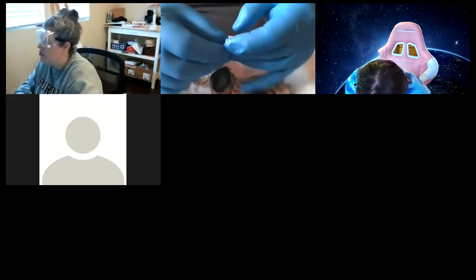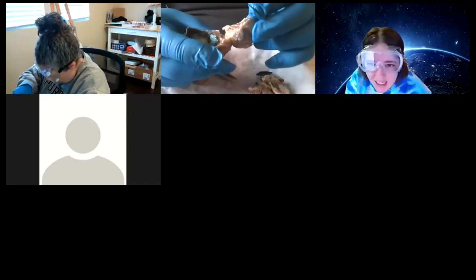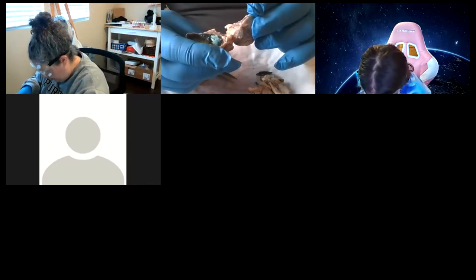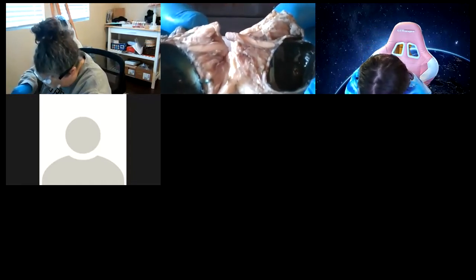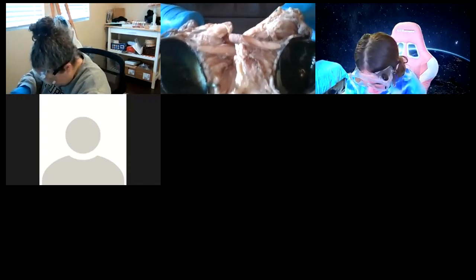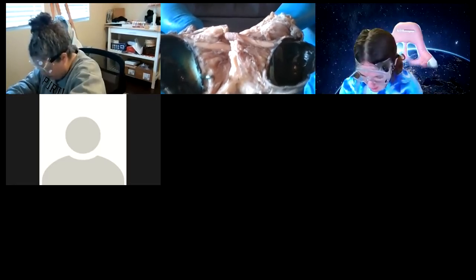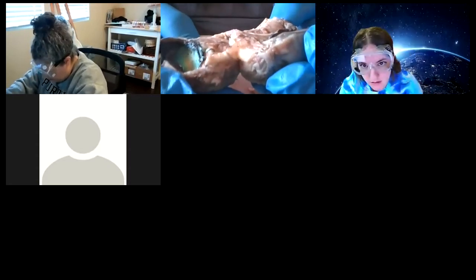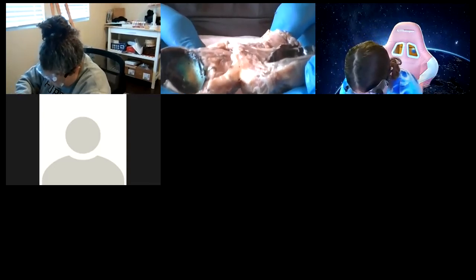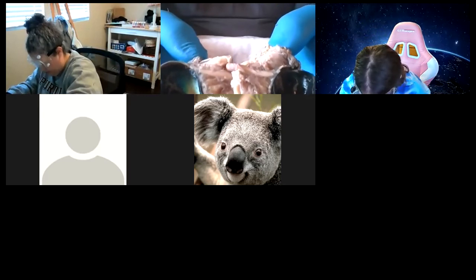I found my iris. In the back of the eye, what's that gritty brown stuff? That could be degenerated muscles. You can see the muscles aligning in there — this is actually a great dissection. You can see the difference in colors of the tissue. The muscle has mitochondria, actin, and myosin — you can see the redness. That could just be some degenerated connective tissue, or frayed muscles that came out in the dissection.